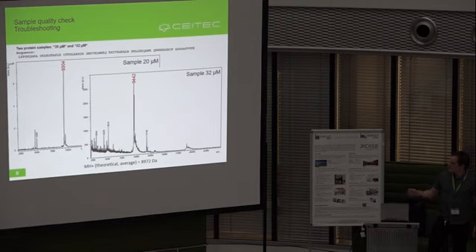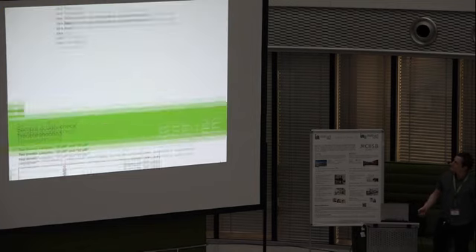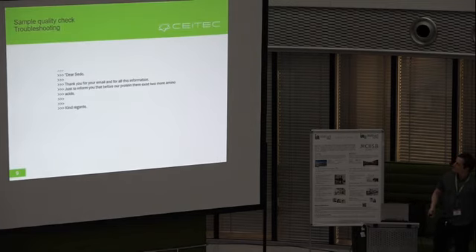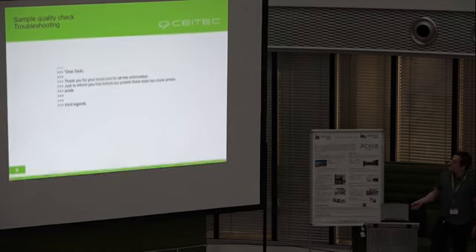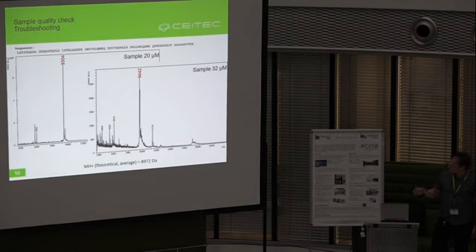And so we sent this result to the customer, asking him what could be the clue, what might have happened. So here is the answer. The customer just sent us information that there are 2 more amino acids that he didn't tell us. However, if we go back to the analysis, the mass difference is higher than could be accomplished by any 2 amino acids.